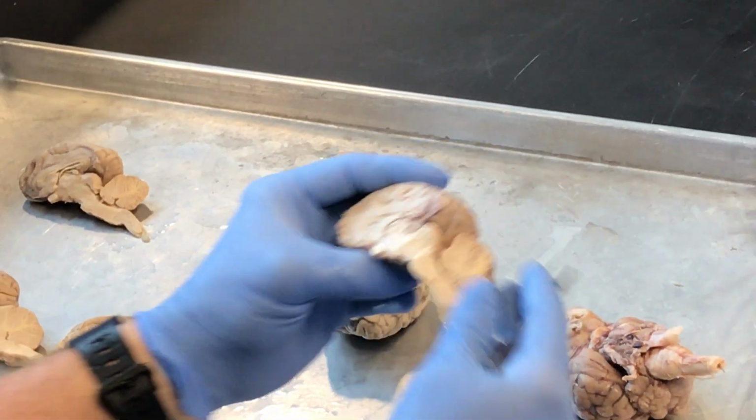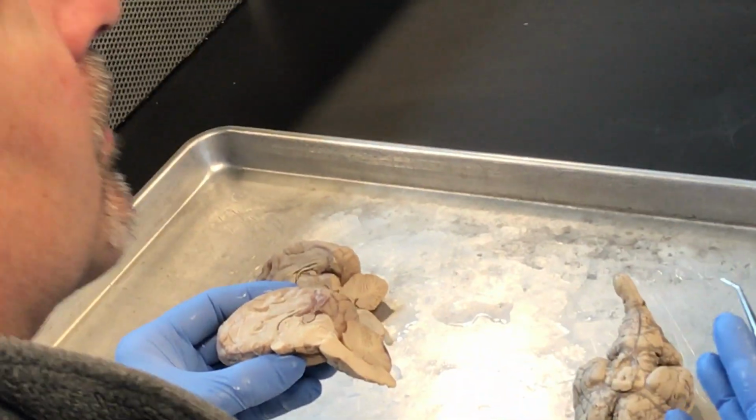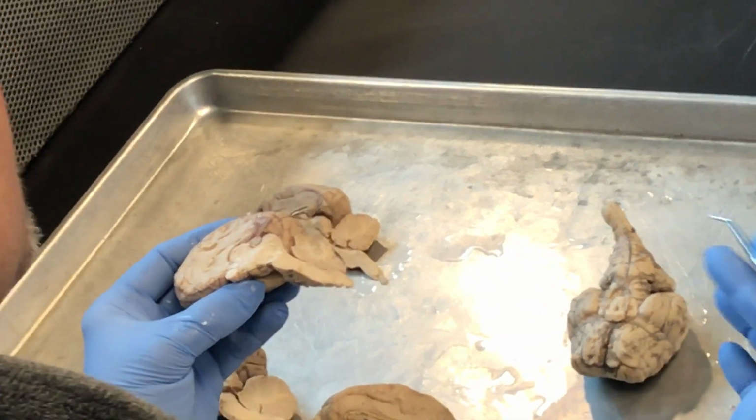The next thing you got is what we call the pineal body. Pineal body, pineal gland, same thing. It's involved in producing melatonin if you care. Many of you right now have it surging through your bodies because melatonin helps you sleep.